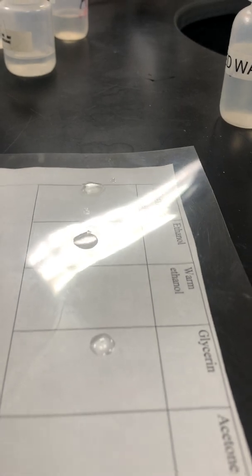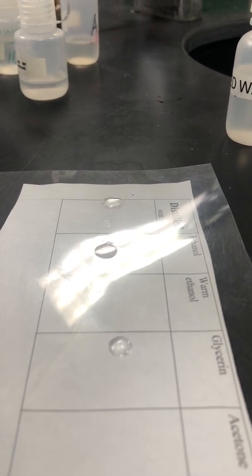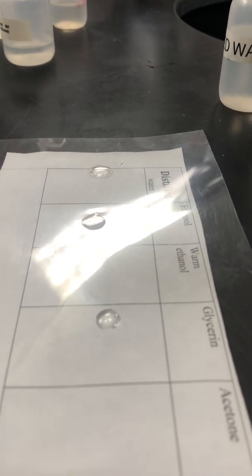So we are at about 3 minutes right now. It looks like the ethanol is starting to be about evaporated, but the distilled water and the glycerin don't seem to be doing a whole lot. Yeah, we got still a little liquid ethanol in there. So would that mean that the molecules in those are strongly attracted to one another or weakly attracted? So that's the thing that you want to be thinking about here. And we got about another minute or so here on the timing.